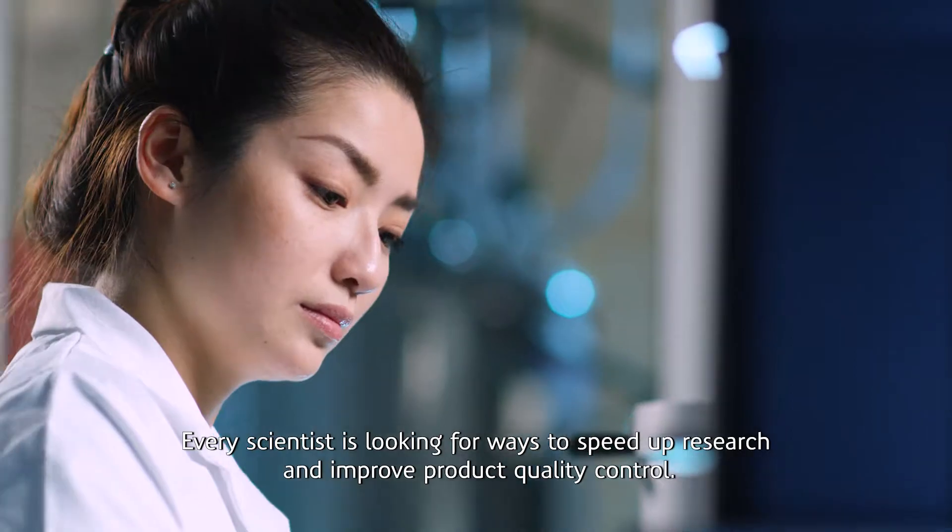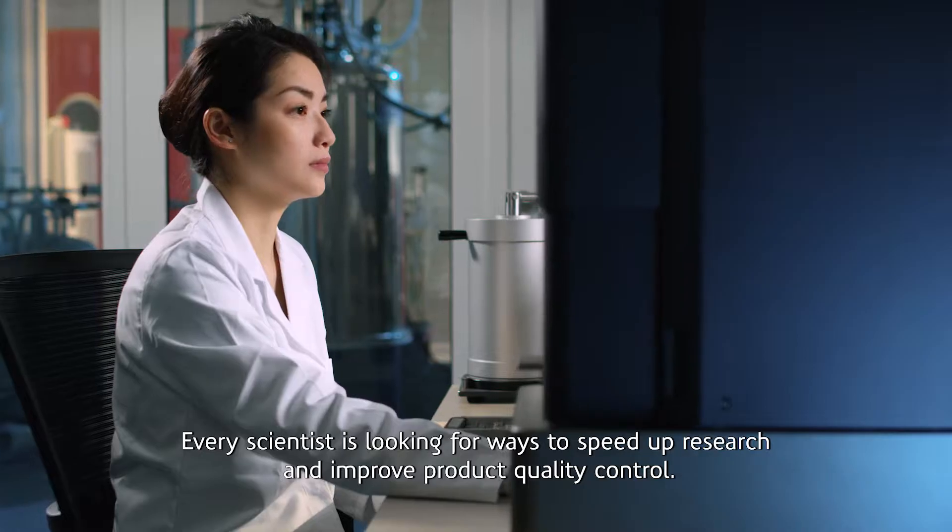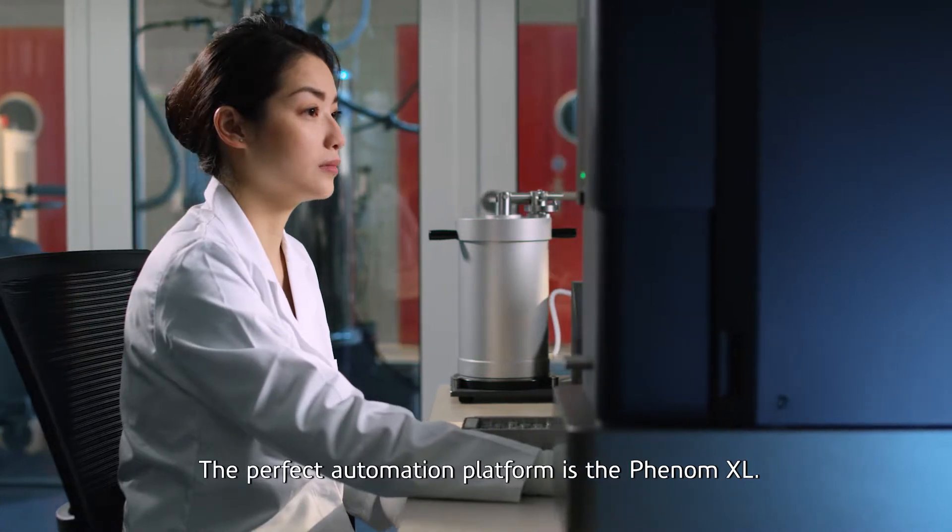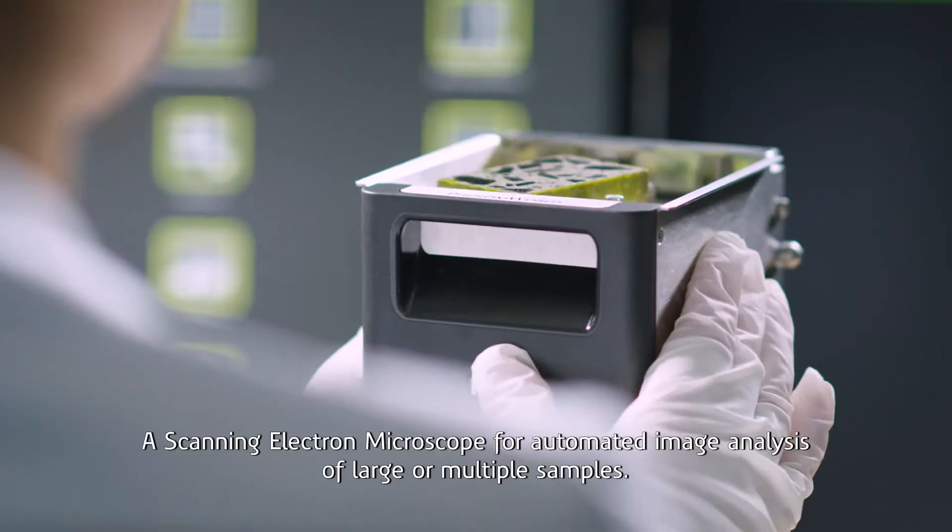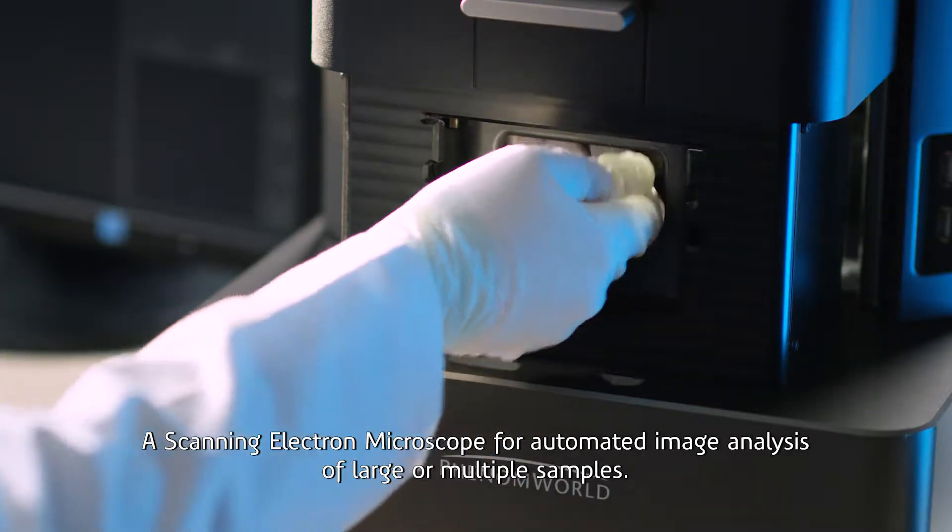Every scientist is looking for ways to speed up research and improve product quality control. The perfect automation platform is the Phenom XL, a scanning electron microscope for automated image analysis of large or multiple samples.